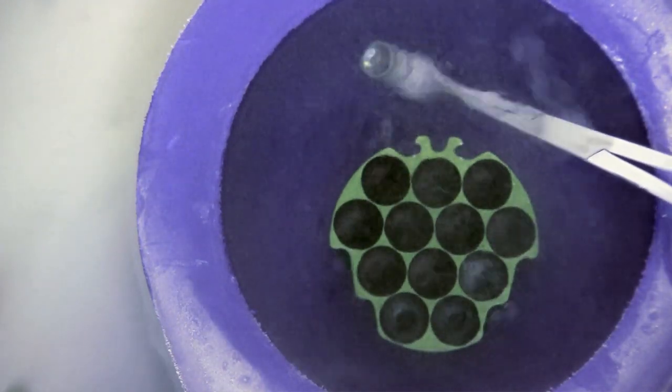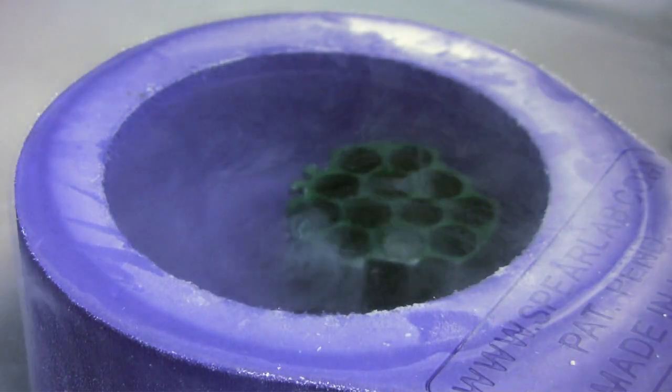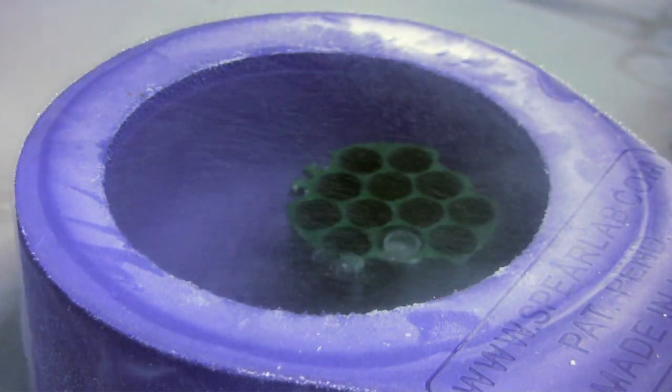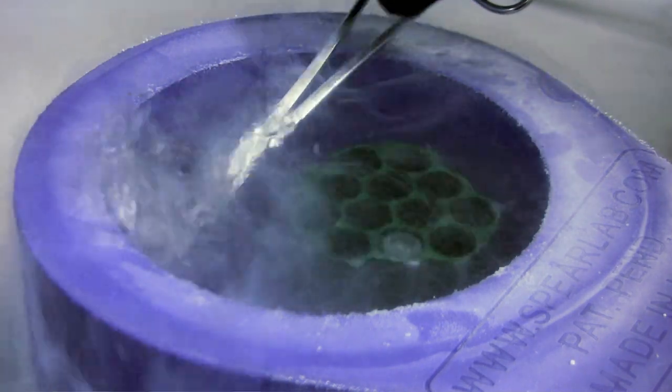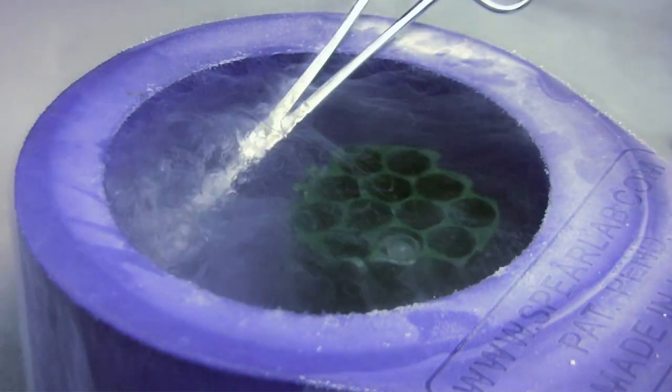After loading, ensure the vial is filled with liquid nitrogen and then quickly inverted by hand into the puck. The LN2 in the vial protects the sample during this maneuver. You may want to practice this a few times before using real samples.